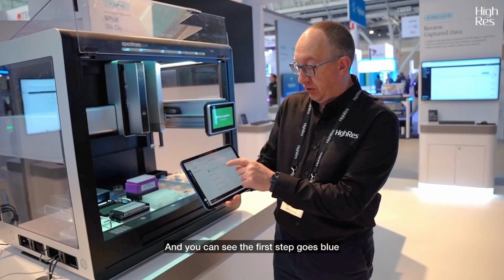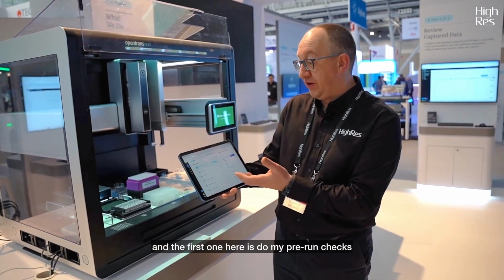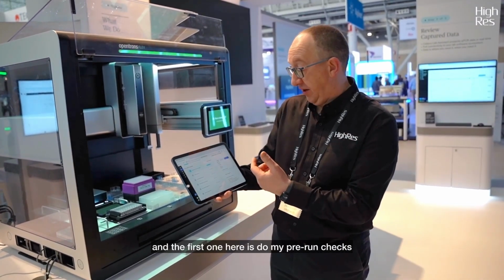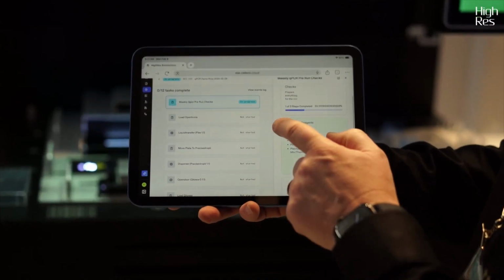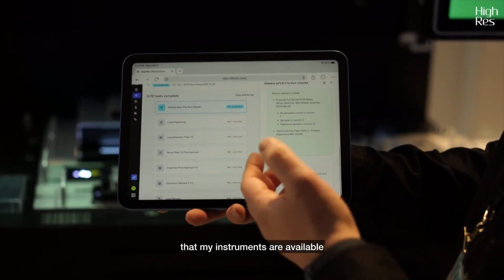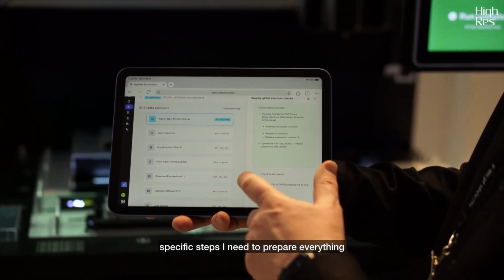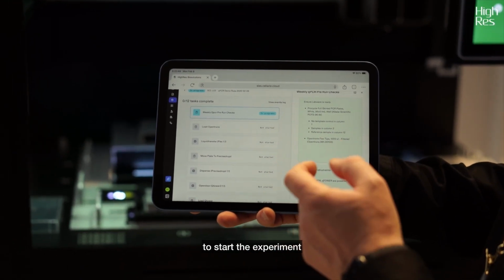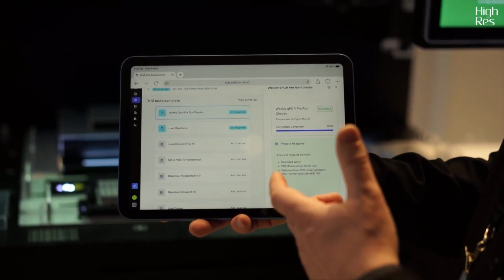And you can see the first step goes blue, just telling me that I need to do something. I can go into that guided task, and the first one here is do my pre-run checks. So I'm going to start that task, prepare my reagents, check that all my labware is available, and then also check that my instruments are available. So it's really guiding me through those very specific steps I need to prepare everything to start the experiment.